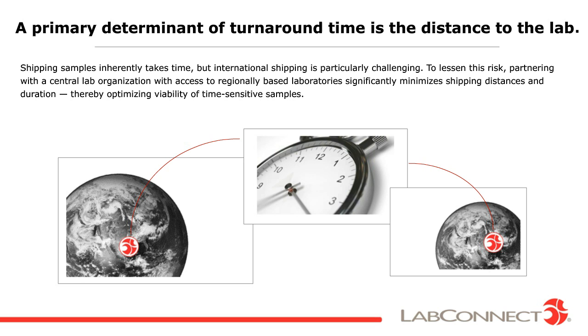I agree here and want to also emphasize that you need to understand the stability of your analyte of interest to help inform your central lab decisions and where to place collections on a regional basis.